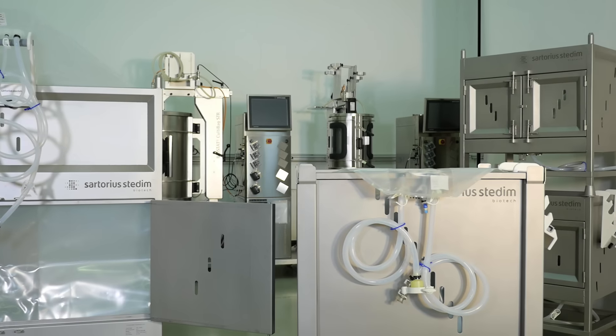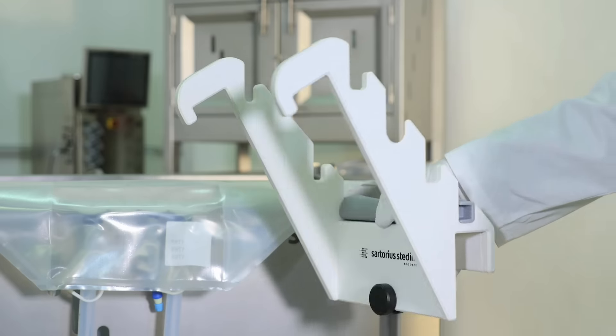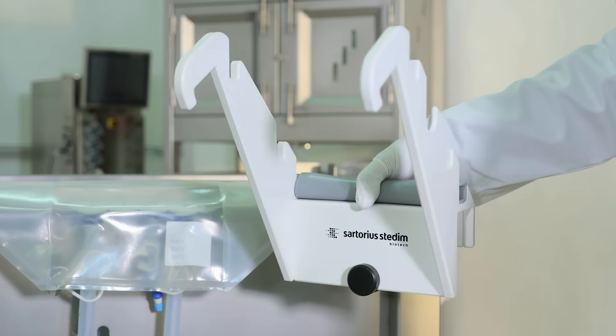Sartorius Stedim Biotech's self-deploying accessory simplifies the handling of FlexSafe 3D storage bags, thus saving operator time.